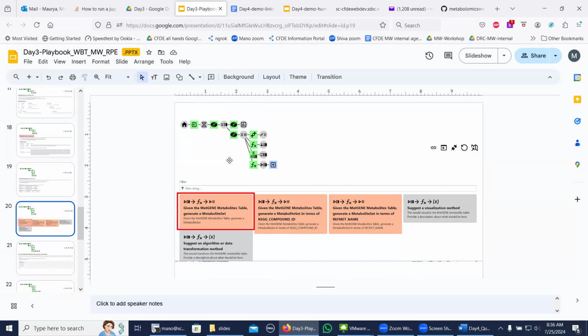In fact, it's a work in progress and a learning process, but this tool also learns what types of workflows users have constructed and what the corresponding summary is for that.